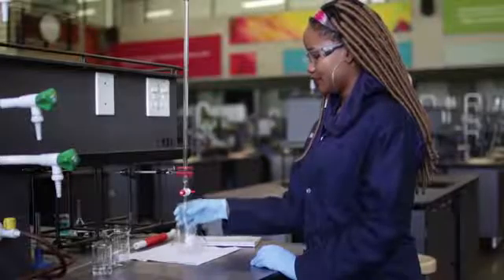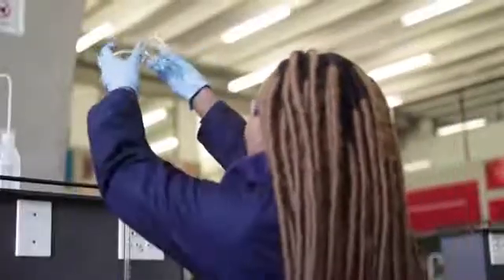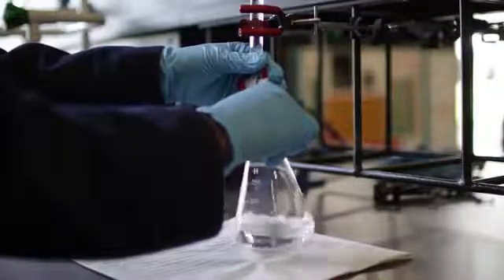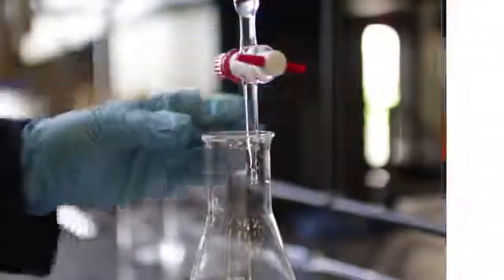The accuracy of the results of your titration will be a reflection of the care you took while performing it. When done carefully, titrations give very accurate, precise results. Here is a step-by-step procedure required for performing successful titrations.